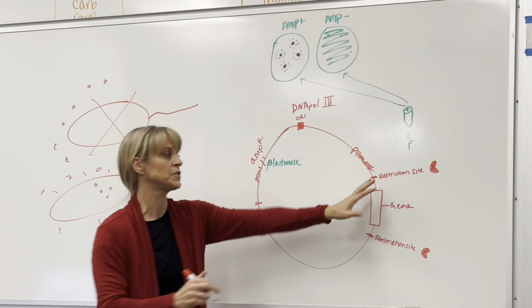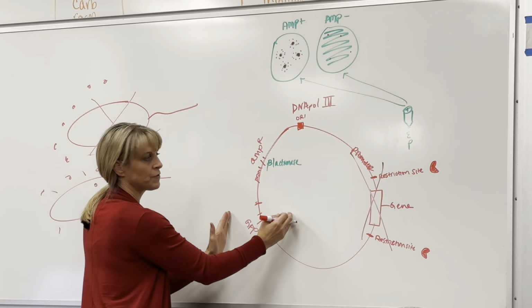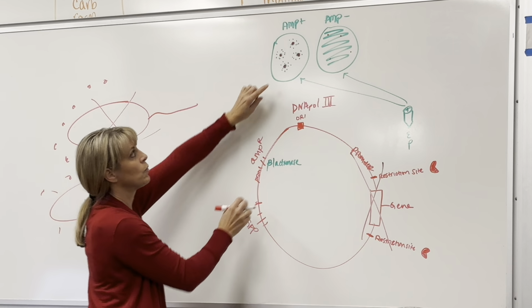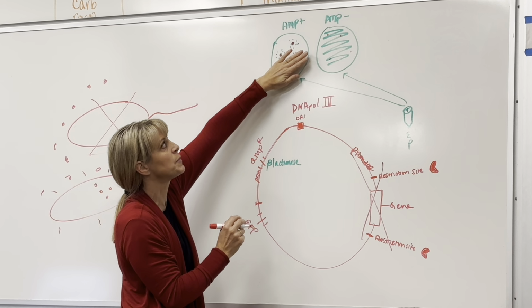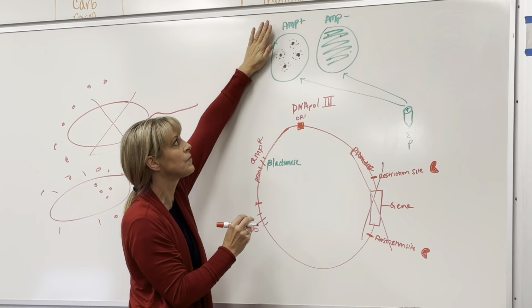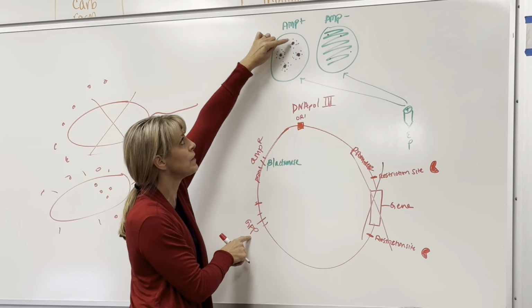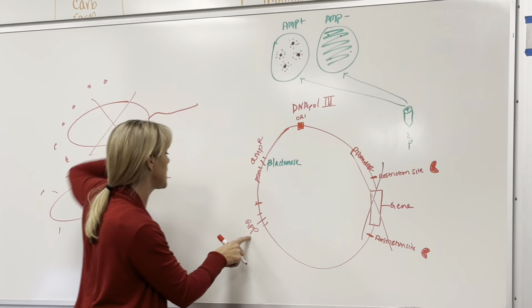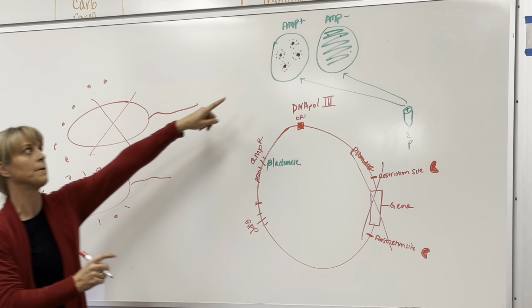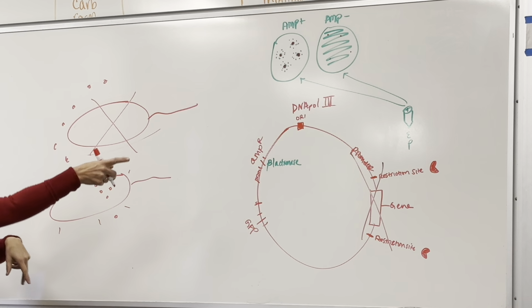So just ignore this for a second. Let's just talk about these two for a second. Very good question, super good question. So here, we looked at ampicillin resistance because the ones that were not ampicillin resistant died for the most part. The ones with GFP, green fluorescent protein, survived because of the ampicillin resistance. So these are the only ones that are living on that plate. Hypothetically. Let's keep going with that for a second and I'll come back to what you're talking about.